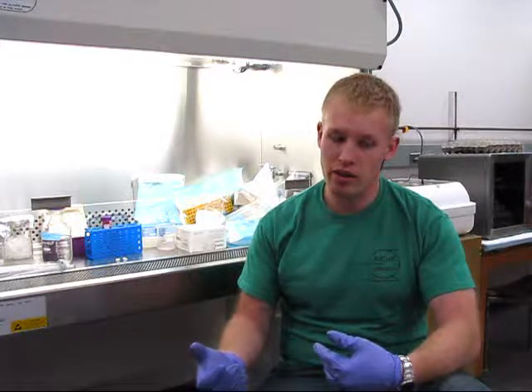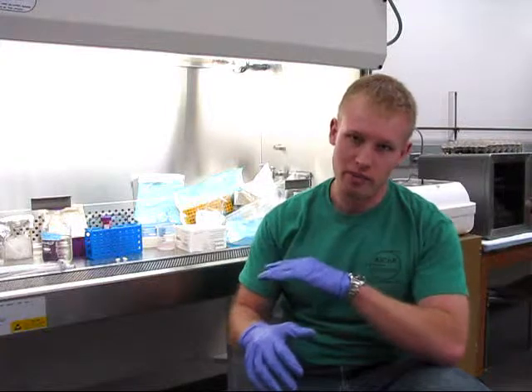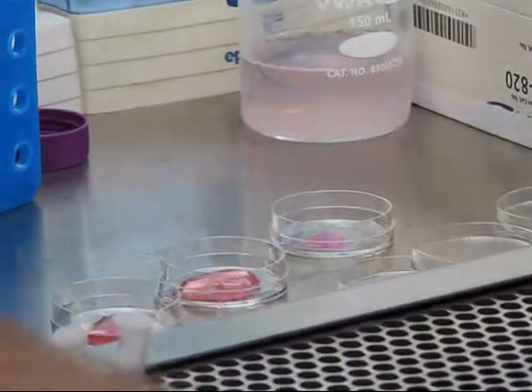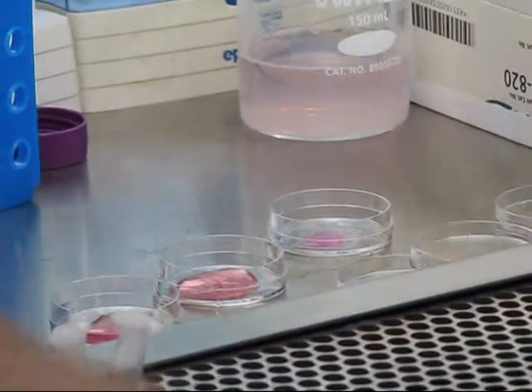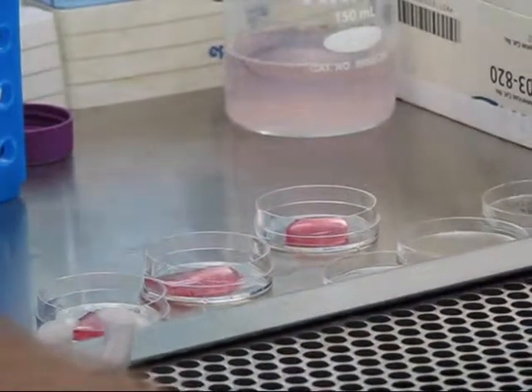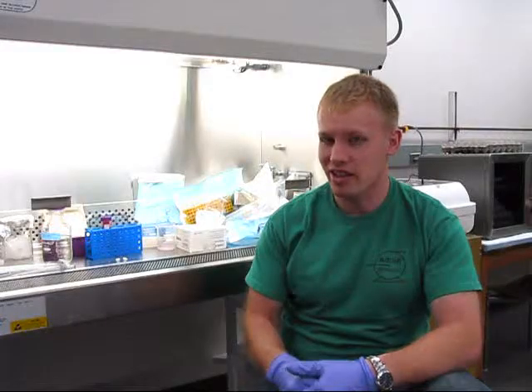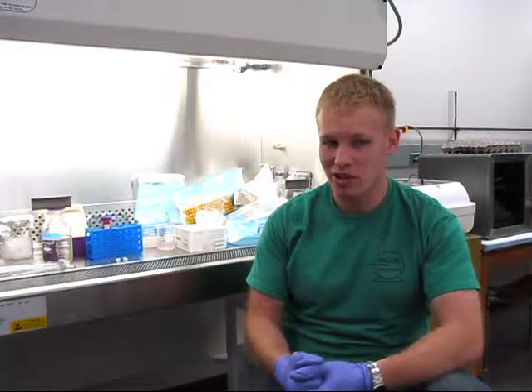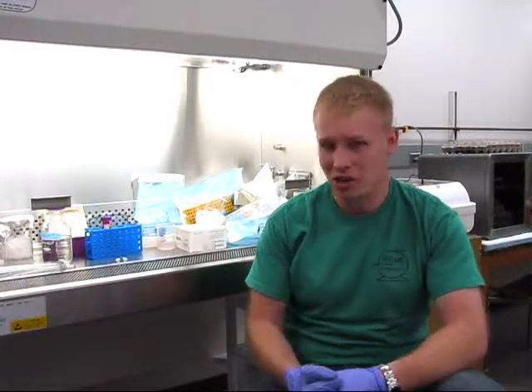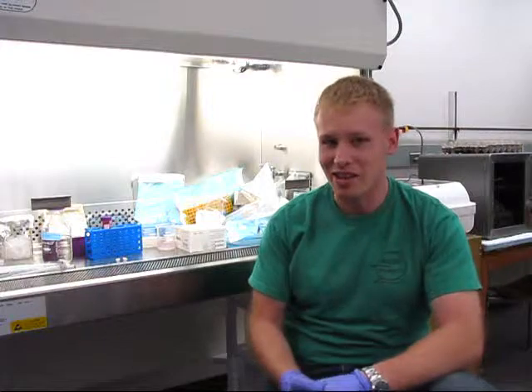What we try to do is grow the cells here in the lab. It takes about a week or so to grow the cells, and then we damage them, and then we test the surfactant mixture. The cycle takes about a couple of weeks at a time, and you analyze your data and do more testing — rinse and repeat. With the reward at the end being that you might actually cure spinal cord injuries, I'd say the time here is definitely well spent, and I love it.